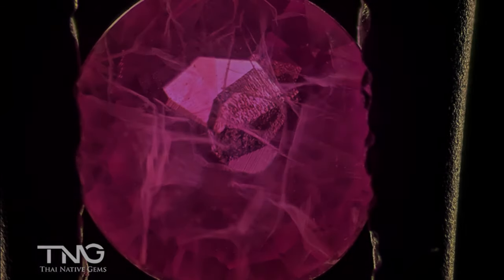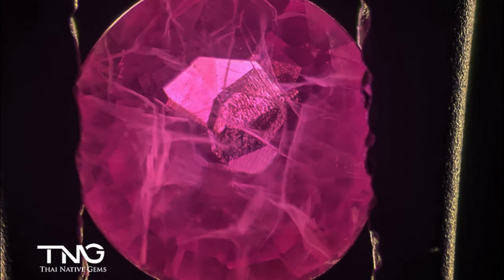So you could even see it through this image which you can see I'm showing you right here. So if you see these wavy checkerboard looking inclusion then you know that this was an intentionally made inclusion made by man and is a synthetic ruby.